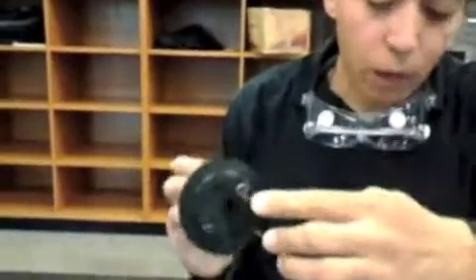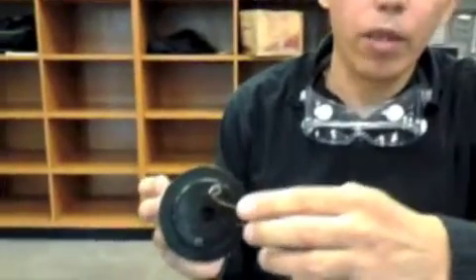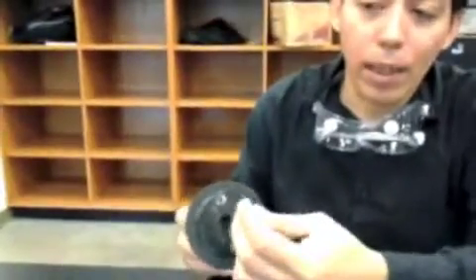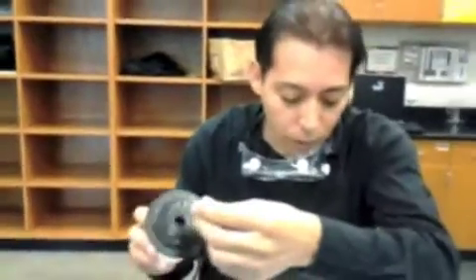Furthermore, as you will see in this lab experiment, we have two electrodes here, and you will see that they form a closed circuit. You need a closed circuit because current needs a complete path through which to flow. They are called electrodes. An electrode is basically a conductor through which electricity can flow.